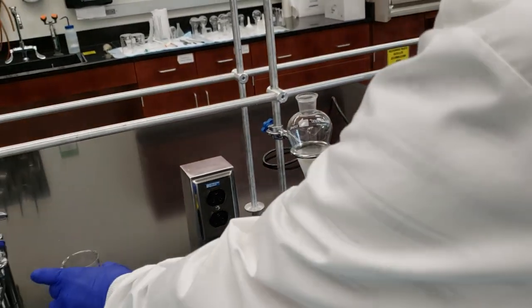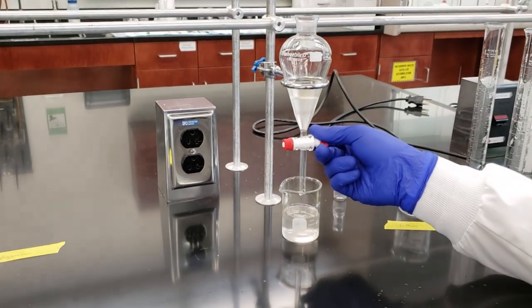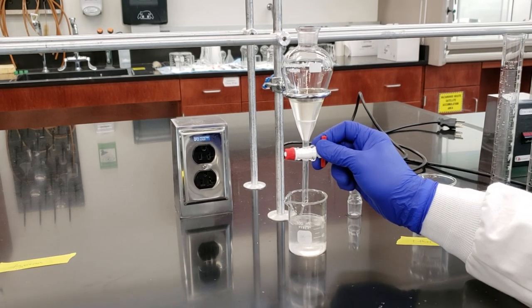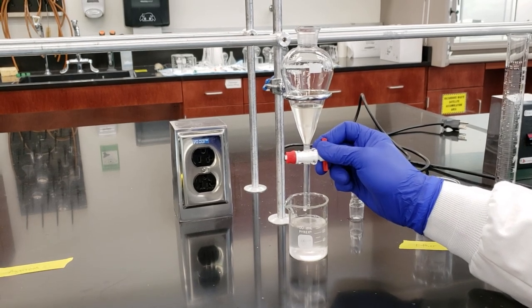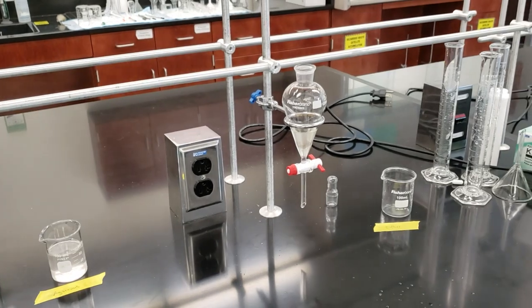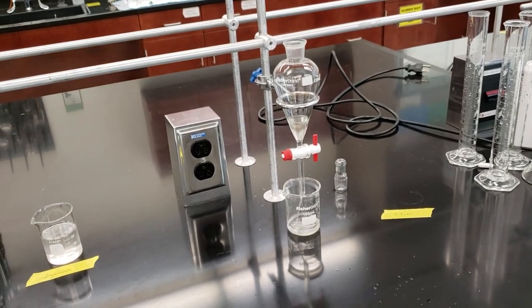Okay, stopper out. Let's go ahead and drain off our aqueous layer first. Still separating out just a bit. There we go. All right, lower layer. All right, lower layer has been removed. I'm going to set this to the side again. Now, we're not going to throw this out until we're done with our entire process. I'm going to take my diethyl ether beaker from before and drain our ether layer into it.